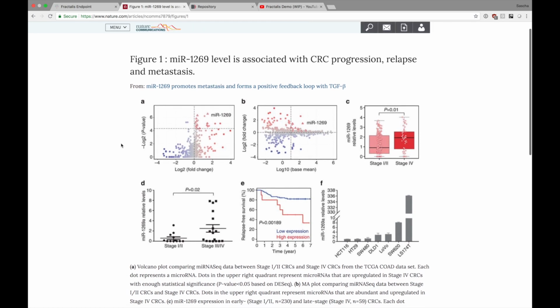The authors did not very well disclose the methods or the parameters that they used in this analysis. So we will have to experiment a little bit. Also, the dataset itself from TCGA grew in the last couple of years. There are now, I believe, roughly 460 samples, and that's roughly 50 or 60 samples more than in 2015.